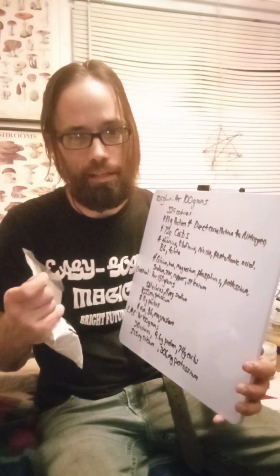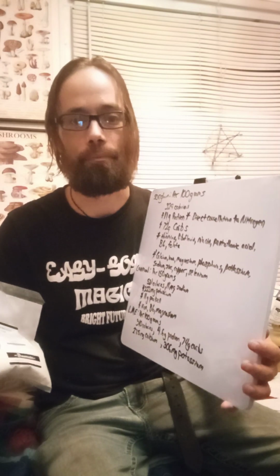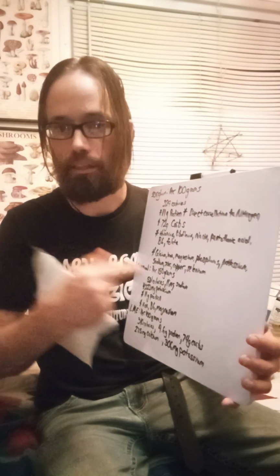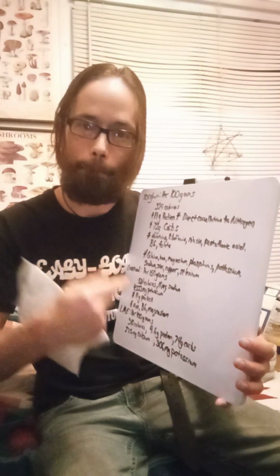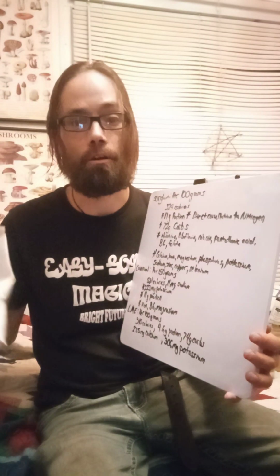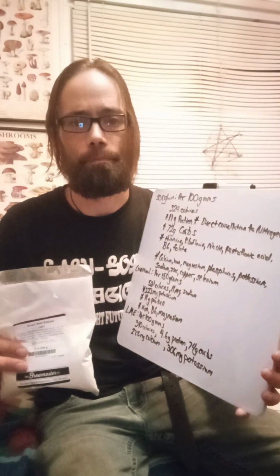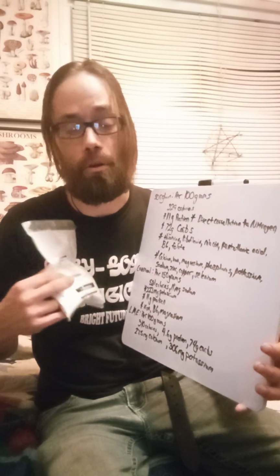All you need is a piece the size of a pin tip to make another plate. So then you get the most out of that, and then you go back to your storage, or you can just keep spending money on plates, or you can buy LC or whatever you want to do. Preferably, I like to maintain my own things.